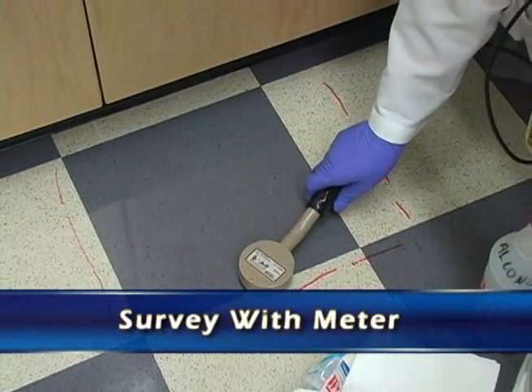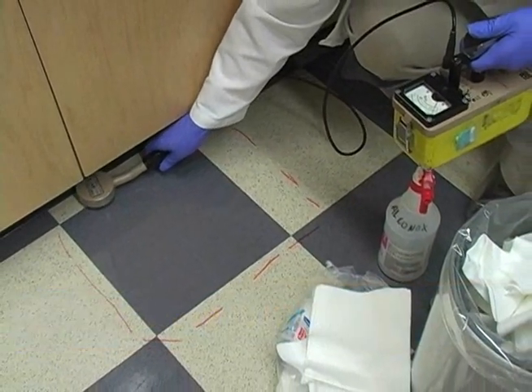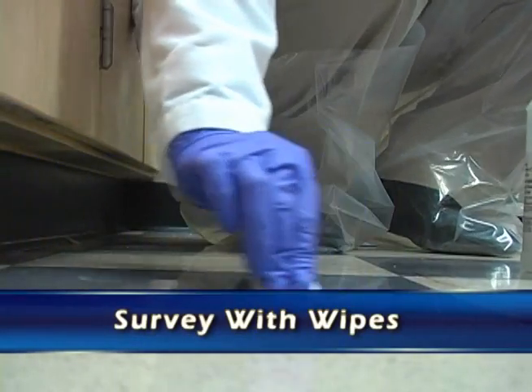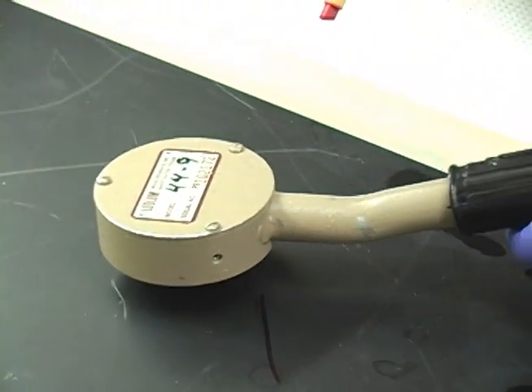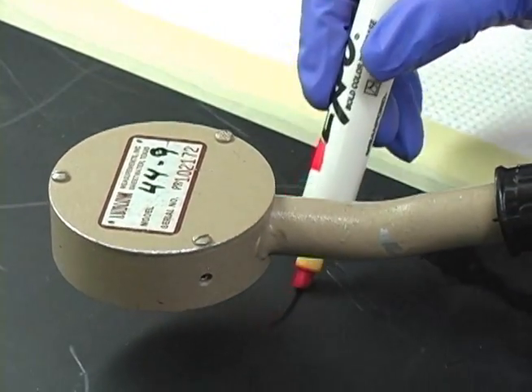We'll survey the area with the meter — slowly, at about two inches per second. Then we'll check for removable contamination by checking with a wipe. Take a wipe and count that in a liquid scintillation counter, or provide it to somebody with a liquid scintillation counter to count.